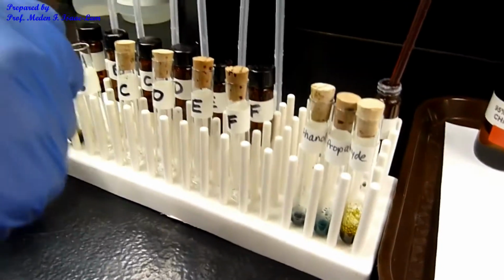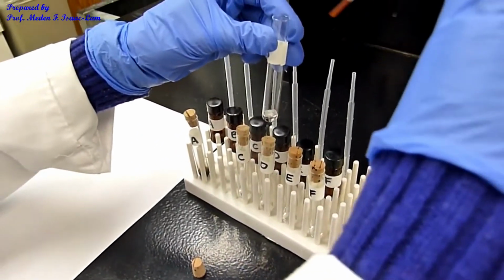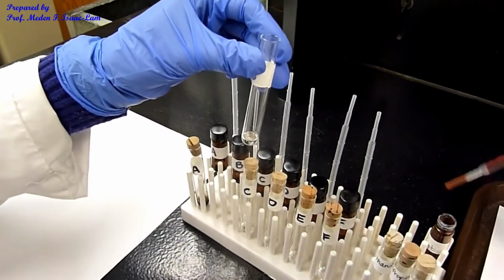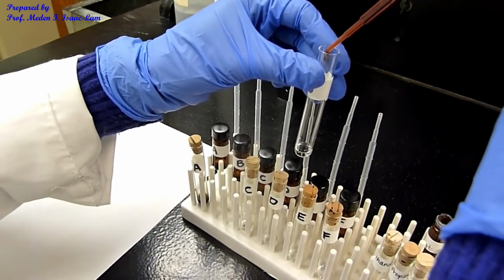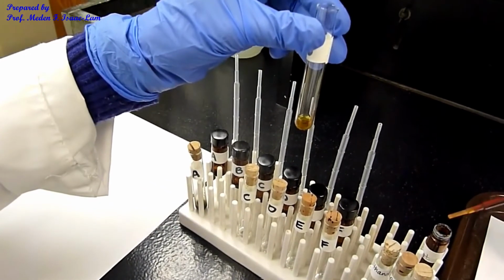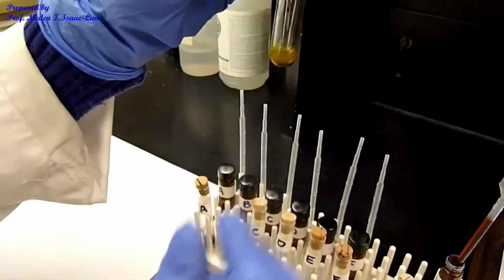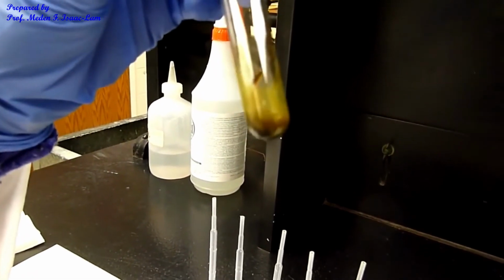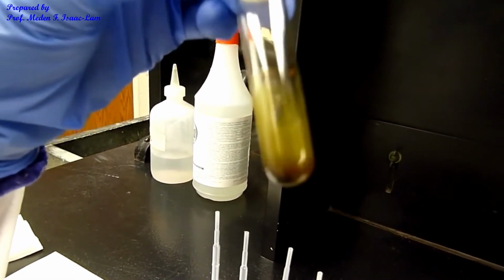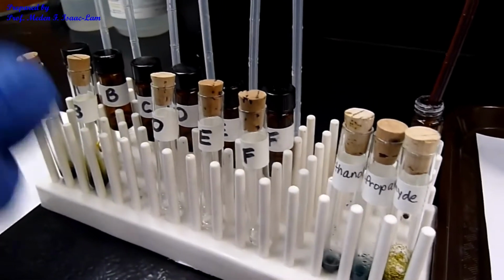So now let's do unknown B. So unknown B, again, 2 drops of the reagent. So you see it actually reacting. So now there's a greenish kind of color on the side. Okay, and then unknown C, the same thing.